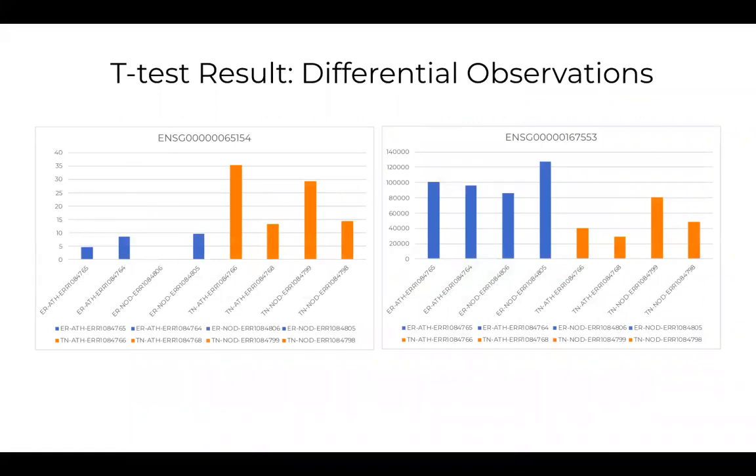If we talk about this one gene, the ENSG gene listed at the top of the bar chart codes for the mitochondrial enzyme ornithine aminotransferase. Ornithine aminotransferase is the enzyme, if I remember correctly. It is a key enzyme in the pathway which converts arginine and ornithine into important neurotransmitters like glutamate and GABA. So it is a pretty important mitochondrial enzyme.